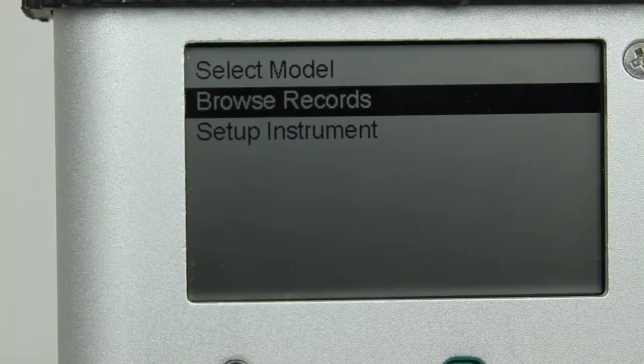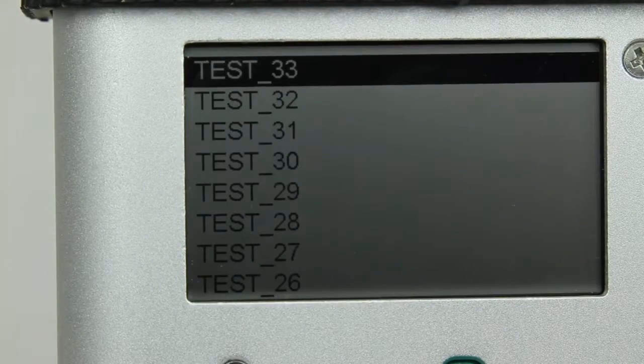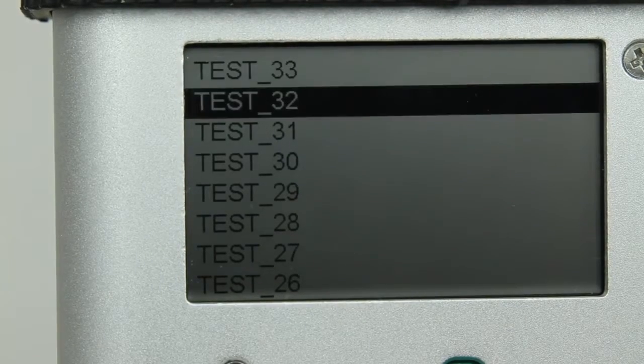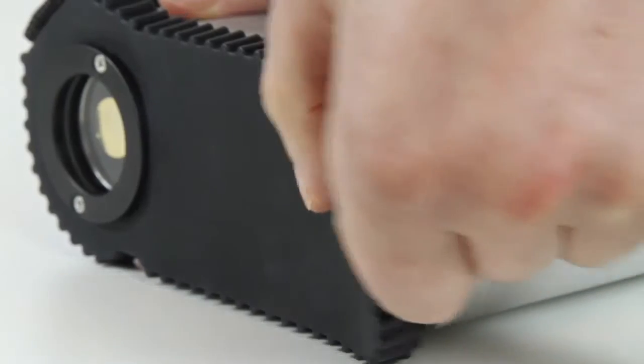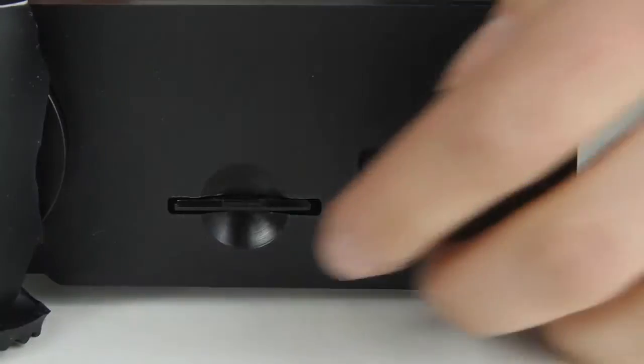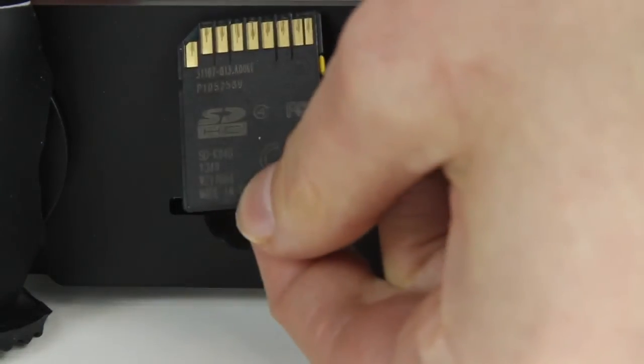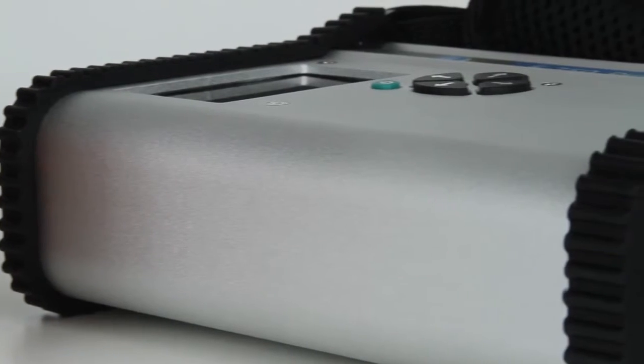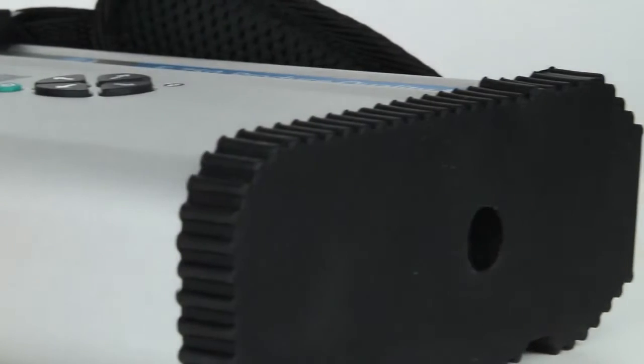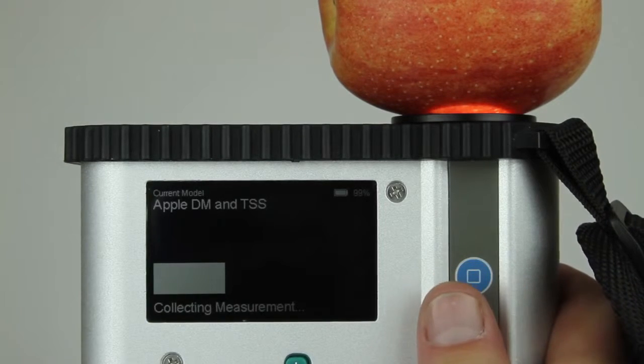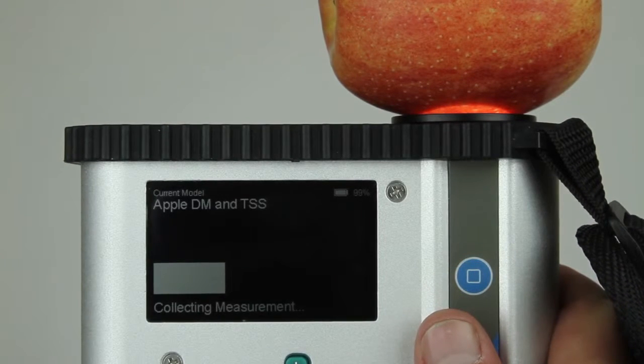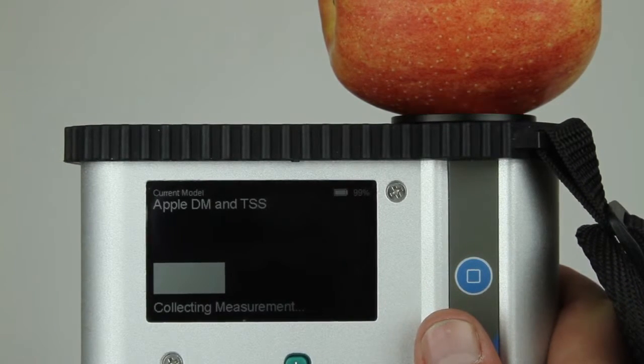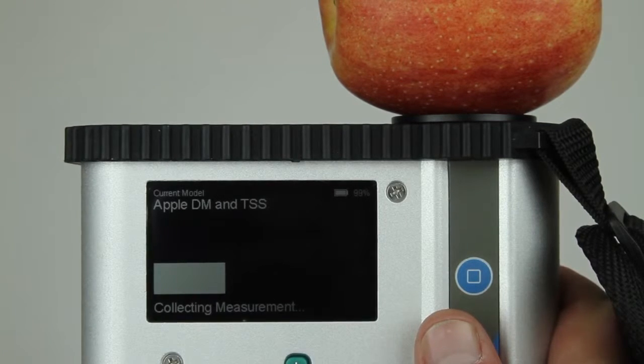The F750 can store up to 25,000 records on its removable SD storage card, which can be collected and analyzed later on a computer. The F750 Produce Quality Meter from Felix Instruments aims to give the agricultural and post-harvest industry superior control over the quality of their products.